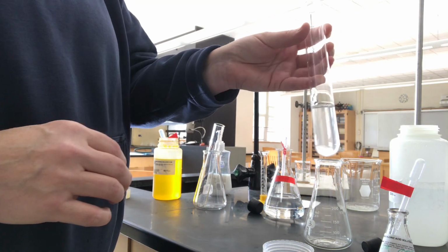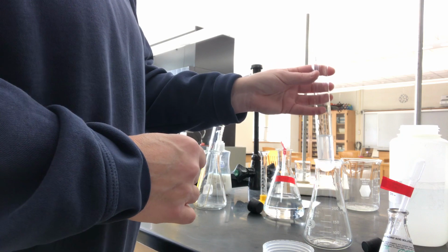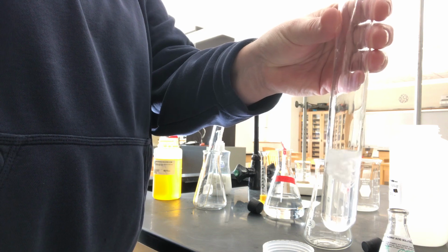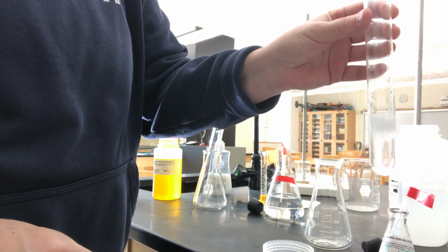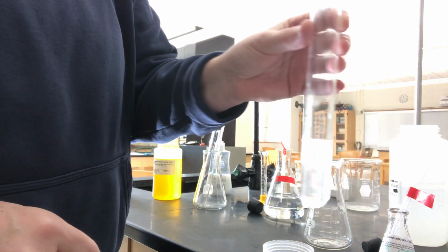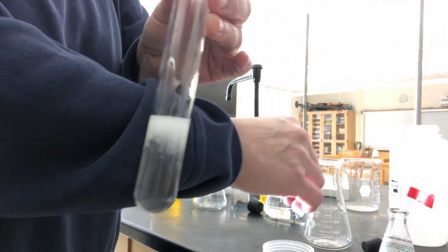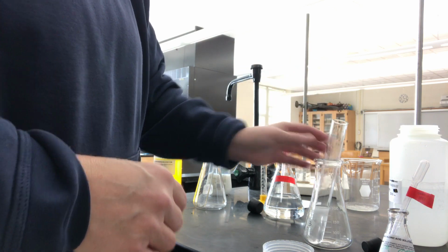It's basically a clear, colorless liquid. And I'm going to add to it another clear, colorless liquid, concentrated hydrochloric acid. So this is just going to shoot some in here. And I think you can see the precipitate forming at the top. So you're seeing some white solid happening there, maybe against my dark. Okay, so you get some white precipitate. So adding the hydrochloric acid is causing us to see a white precipitate.